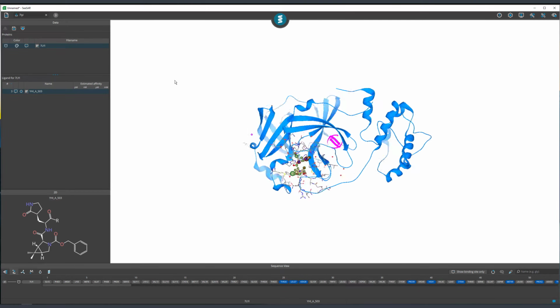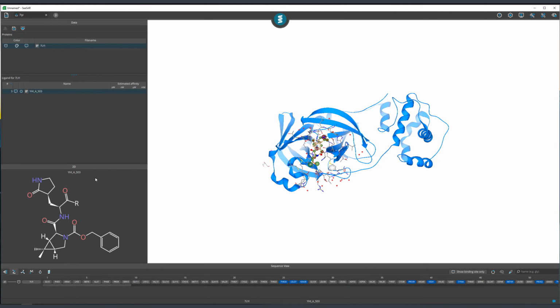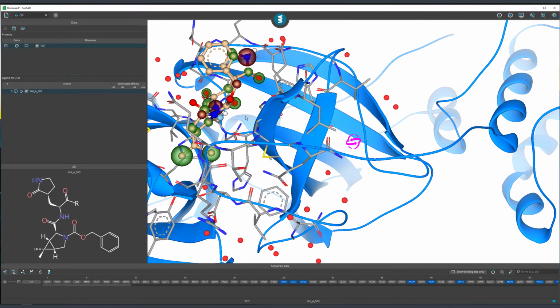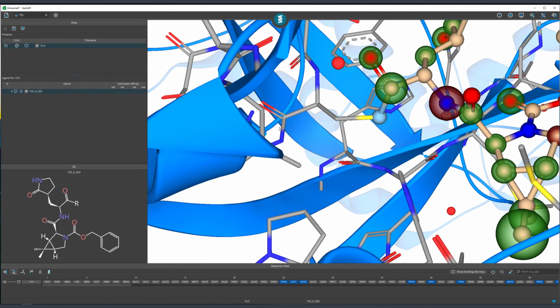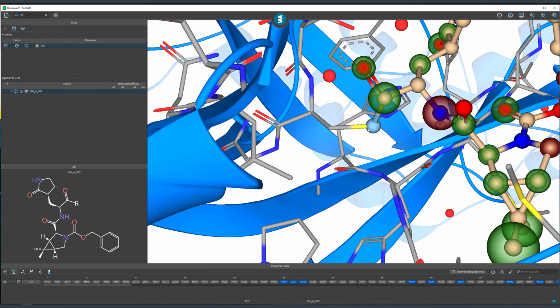interest in this protein. And as a confirmation, the same image that we saw in the slide earlier is also available in the 2D window here, along with the R linker atom present here. In 3D, the linker atom is shown by this light blue R cyan atom represented at the point of covalent attachment on the protein.